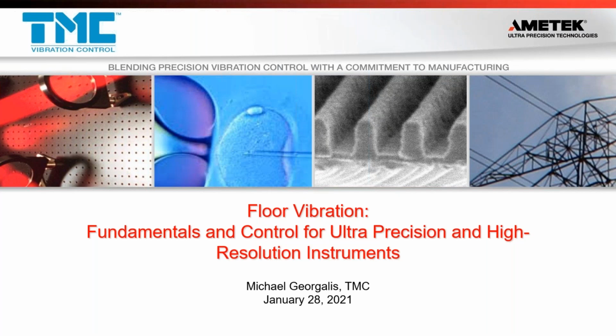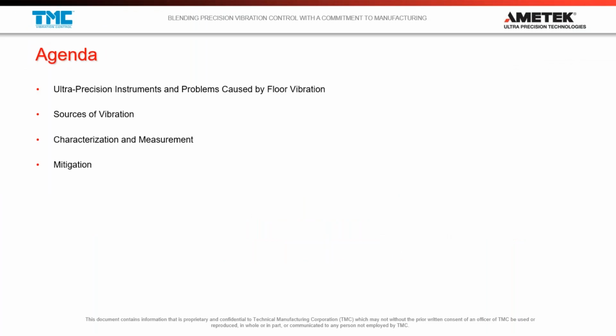Today's presentation is entitled Floor Vibration, Fundamentals and Control for Ultra Precision and High Resolution Instruments. On today's agenda, we're going to start by talking about what an ultra precision instrument is and the problems that we see in them caused by floor vibration. So we're going to identify some of the instruments and tools that are highly sensitive to floor vibration, and go over some examples of what you're going to see in their image or in their resolution due to vibration issues.